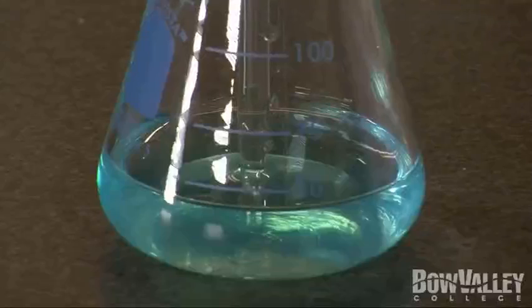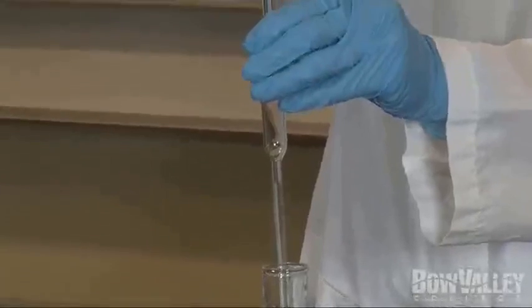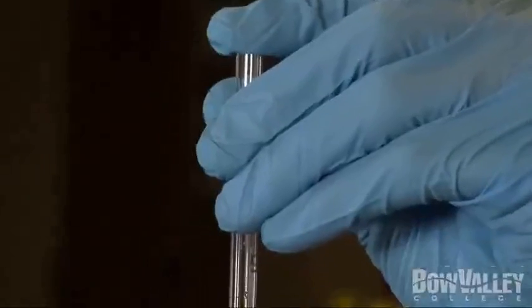Slowly release your grip on the bulb and allow the liquid to rise up the pipette. You should allow the liquid to rise above the line marked on the pipette, but stop before the liquid level reaches the bulb. Remove the bulb and quickly cover the end with your index finger, creating a seal. Slowly lift your finger and allow the liquid to exit until the bottom of the meniscus is sitting on top of the line marked on the pipette.